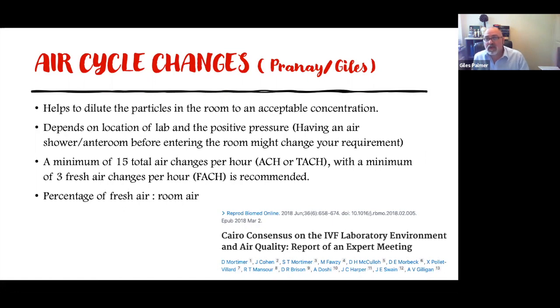We've been using clean room clothes for years in some of the labs I work with. It doesn't have to be the bunny suit, but it can be fiberless material, high neck, long sleeve. It's very comfortable even in subtropical areas, because if you think about scrubs and you tap them, you can see that they give off a lot of dust and a lot of things that you do not want in your air. So I'll leave it at that.